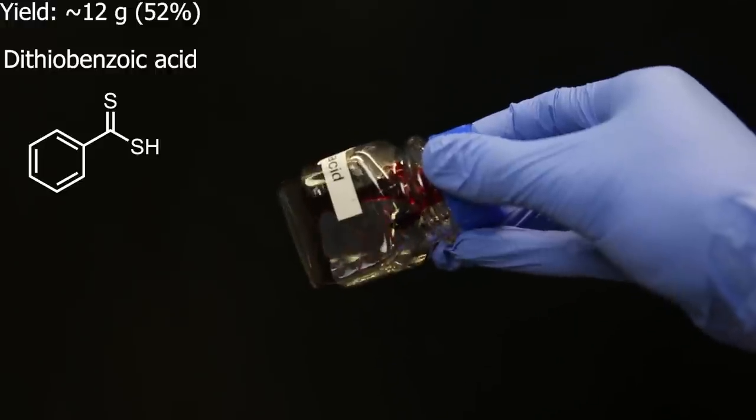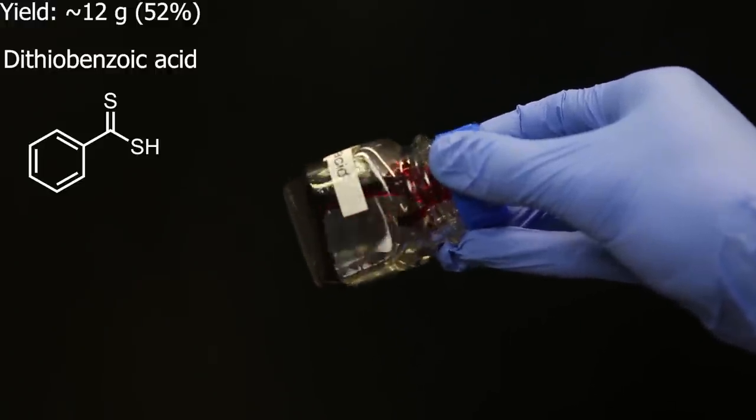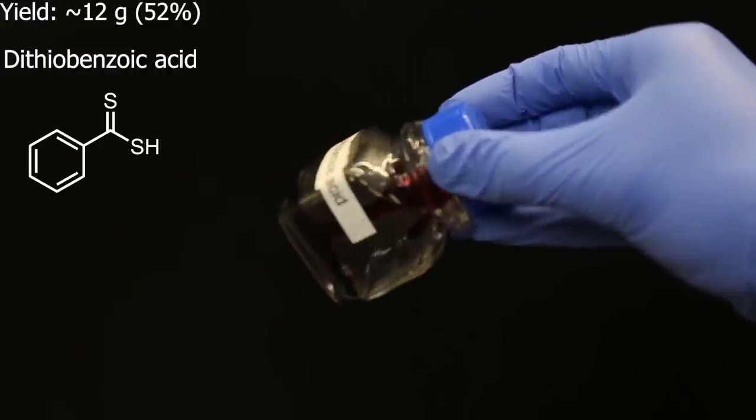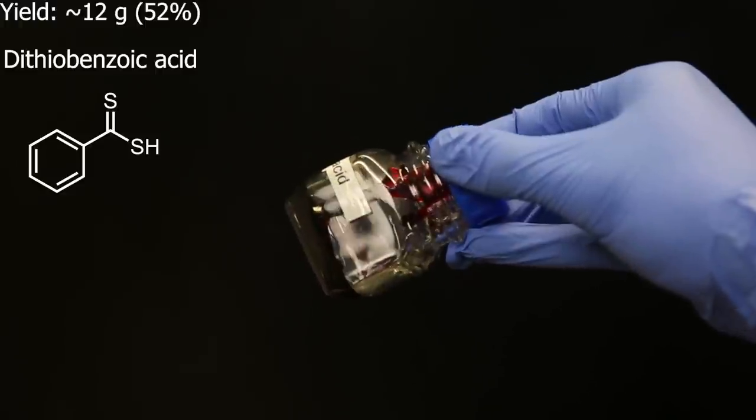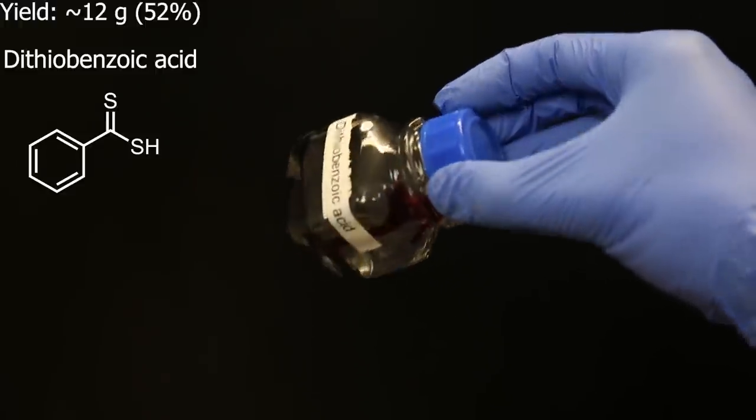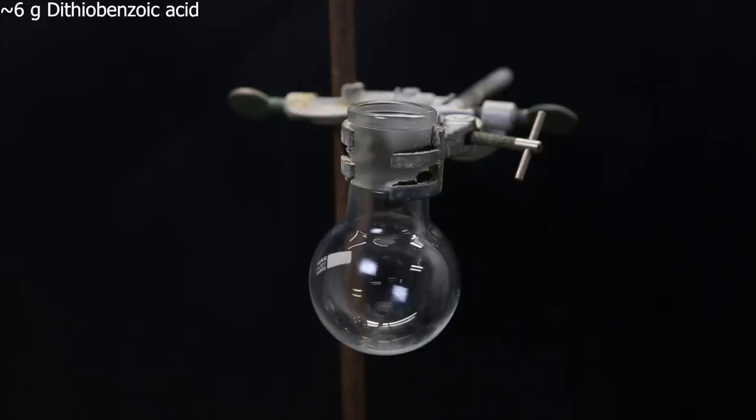When that is done, I measured the yield to be about 12 grams, of which I transferred half to this container. The dithiobenzoic acid is a dark red sticky solid, with a melting point close to room temperature.